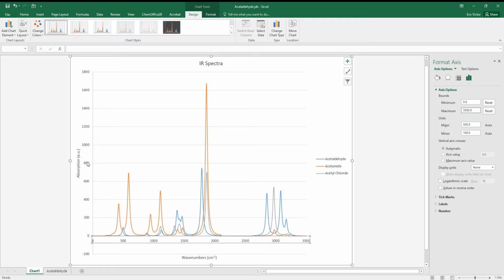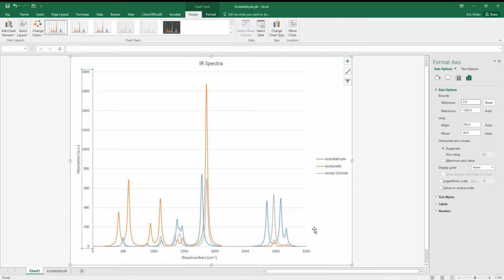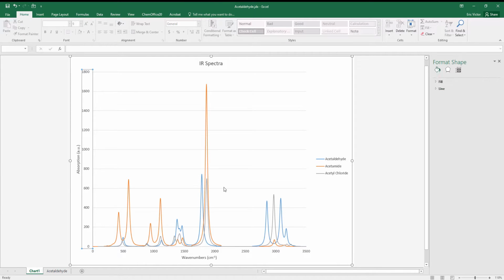And then for the vertical axis, if I click on that now, I can change this to starting off at 0, right, because there's no negative intensity. Right, and so that's all of that set right there, right? So all of this is set. I mean, one thing you can do, I hate Calibri, right? I would say you should always try and change it to Arial, right? Arial is a much better looking font, in my opinion.